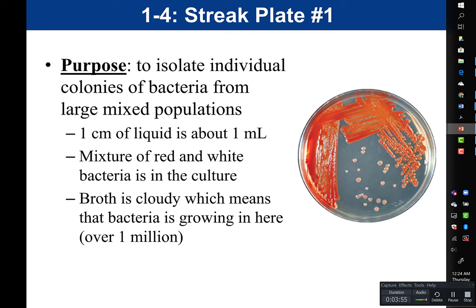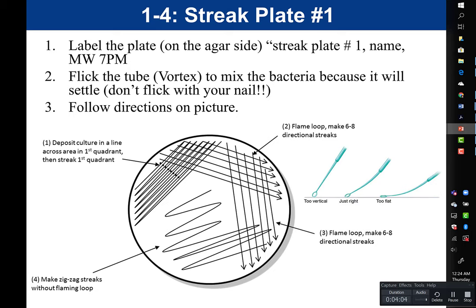We would have our agar plate, and we always label the plate on the agar side — not the lid, because if the lid were to fall off, we don't know what's on the plate. We label along the edge: streak plate number one, your name or initials, your class period, and the date of the experiment.